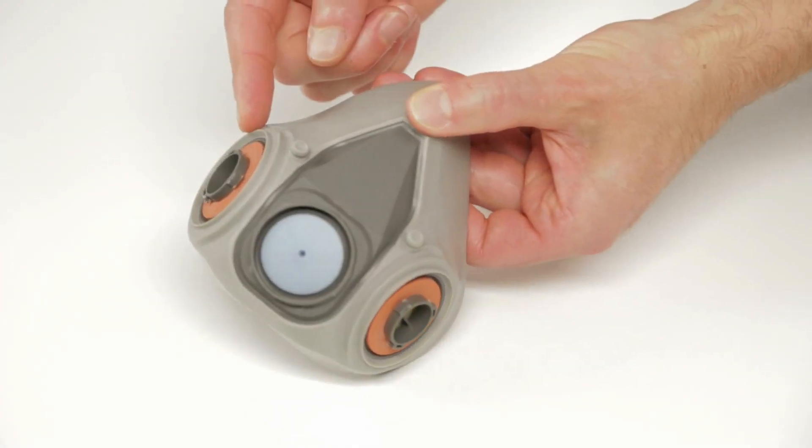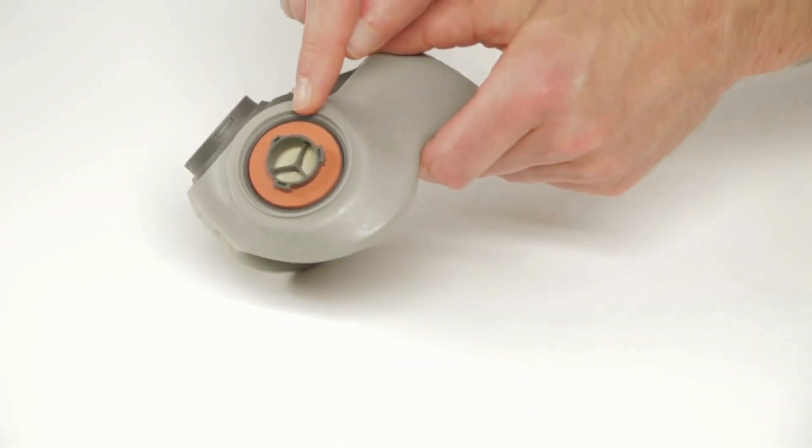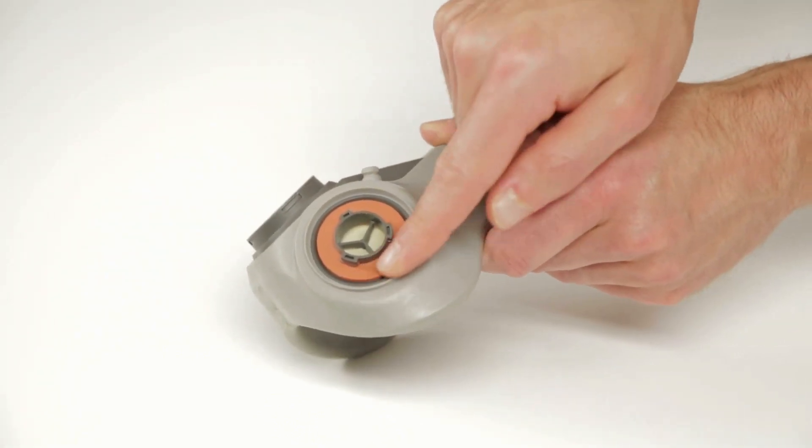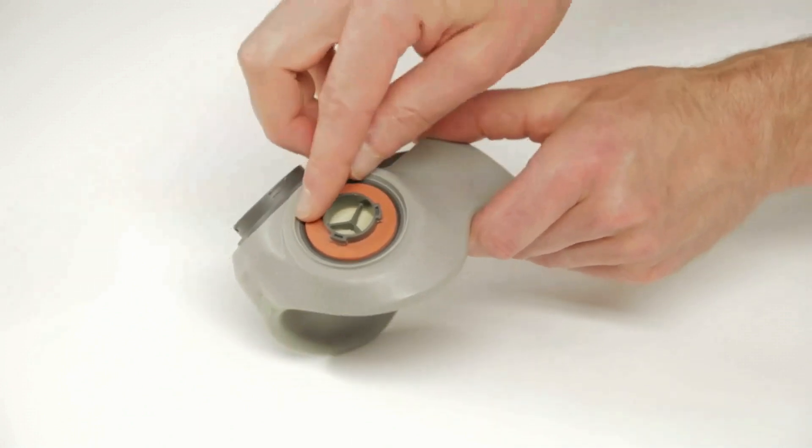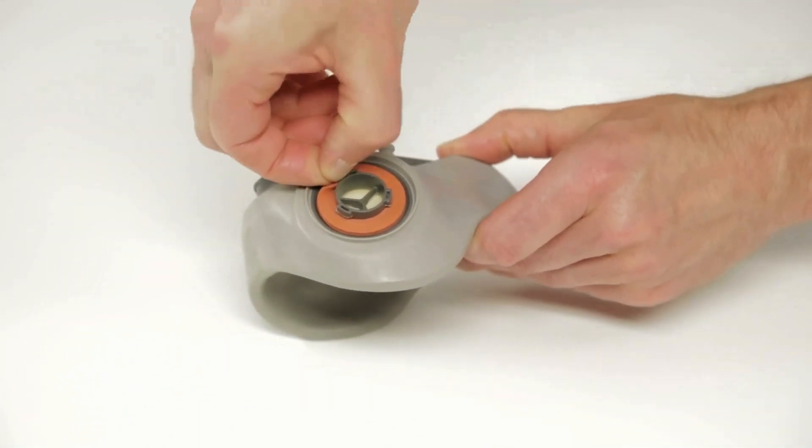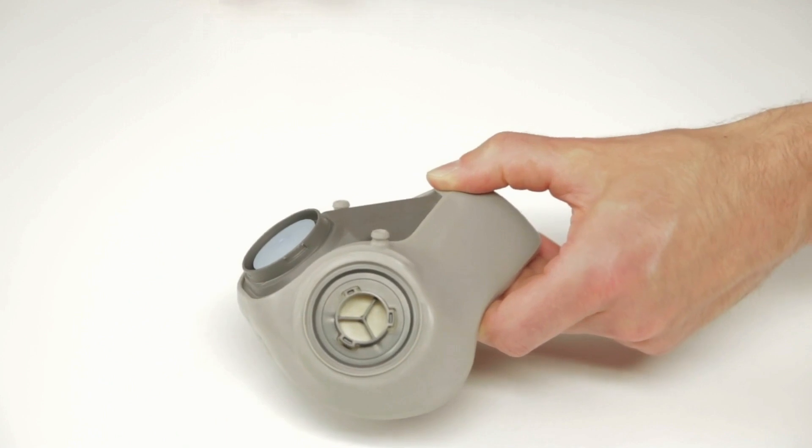The two red gaskets are designed to seal the interface between the facepiece and the filters, cartridges, or dual air line. They should be inspected before each use and replaced if lost or damaged.